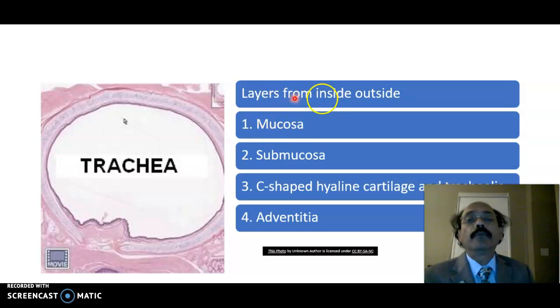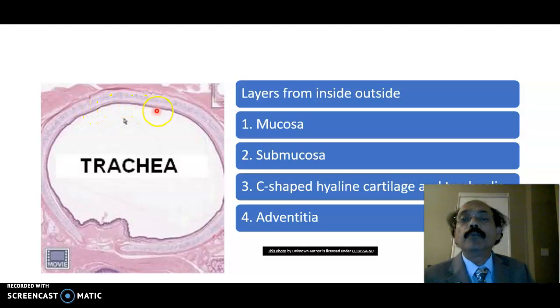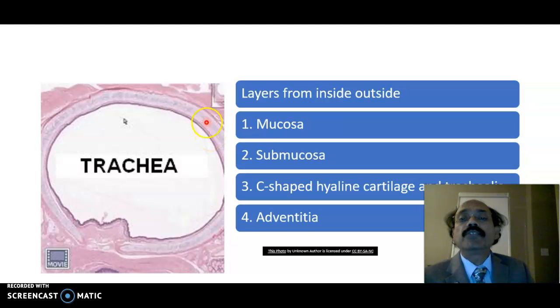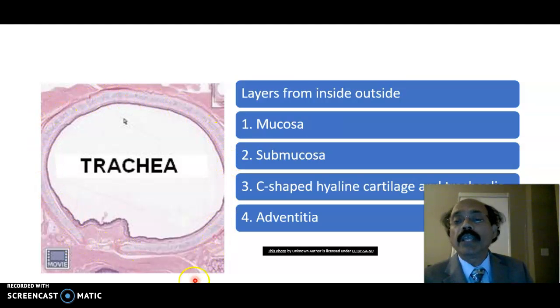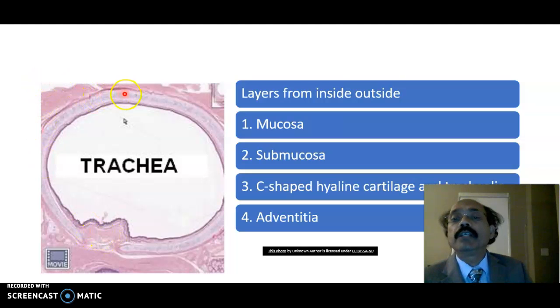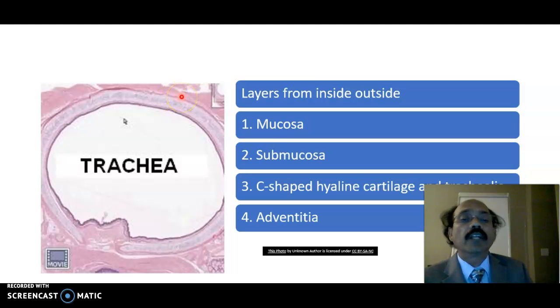The trachea has four layers from inside to outside. The inner layer is the mucous layer. Then underneath the inner layer we will get the submucosal layer. Then we will get the C-shaped hyaline cartilage ring. Outside the C-shaped cartilage we have the adventitia, which is the connective tissue.